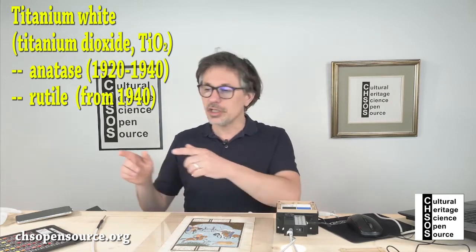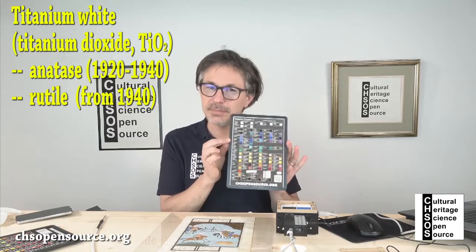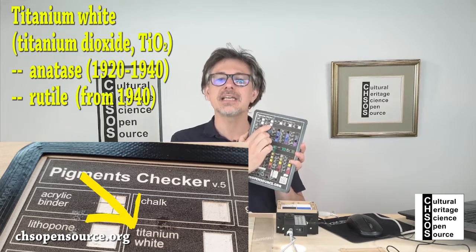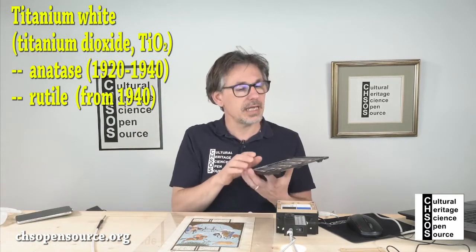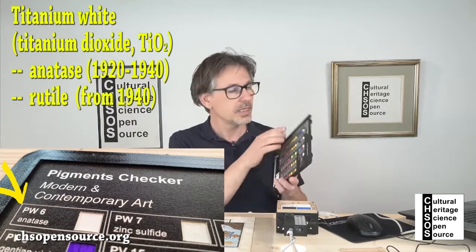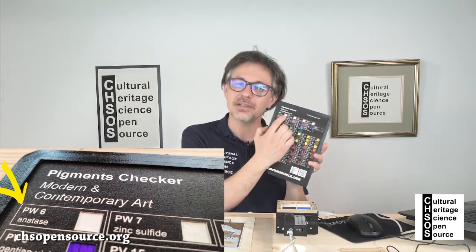The pigment checker has both these forms. The standard pigment checker, over here, titanium white, has the rutile form. On the other hand, the modern and contemporary pigment checker, among the whites, over here, has anatase. So this is the other titanium white.